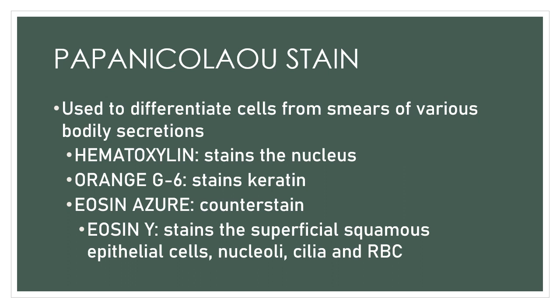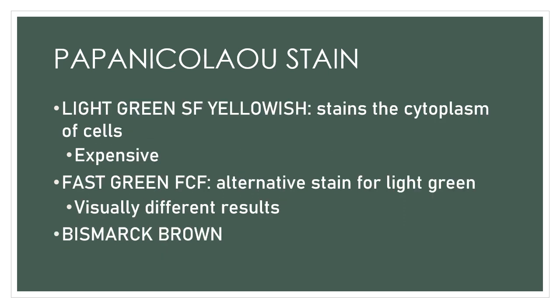And then, of course, next you have your light green SF yellowish, and it stains the cytoplasm of your other cells, including your non-keratinized squamous cells. But then it is expensive and hard to obtain, difficult to obtain.